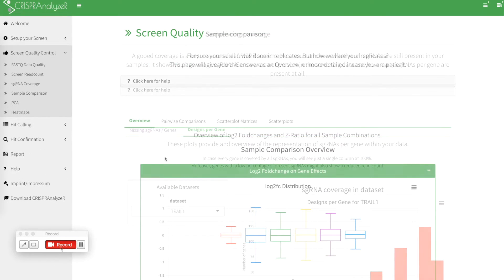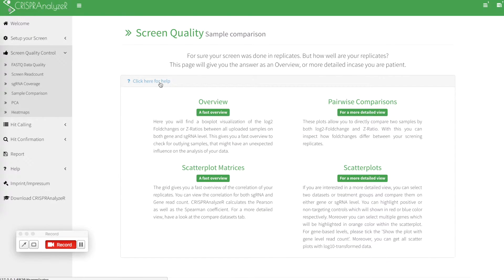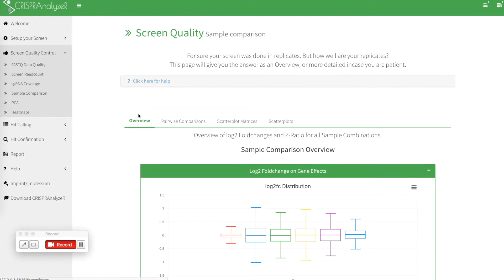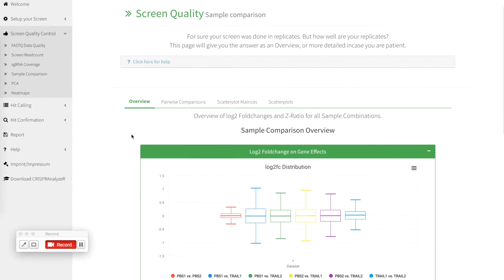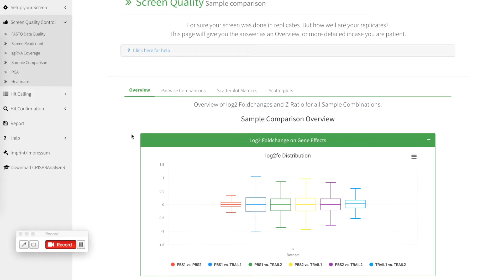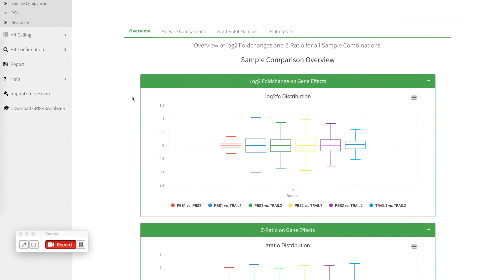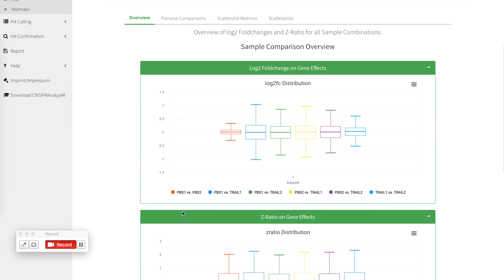Another nice feature of the screen quality section is the sample comparison. Again click here on the help for more detailed information what it offers. So in general the screen quality section gives you an overview directly comparing for example the log2 fold change distribution for different samples.